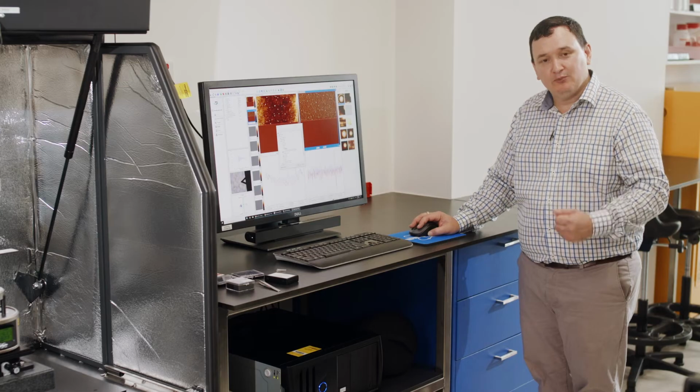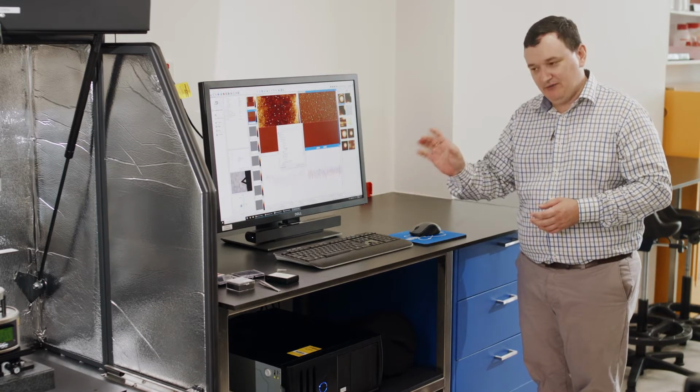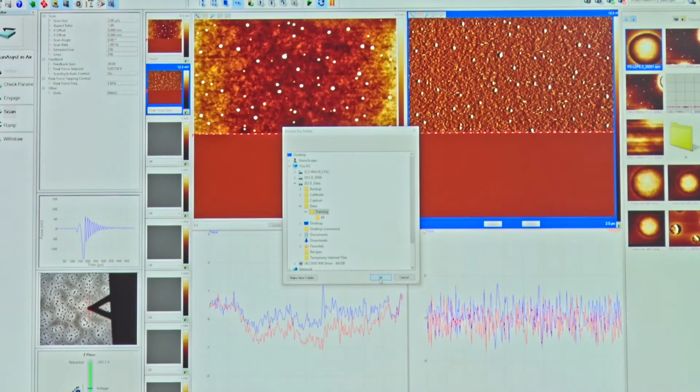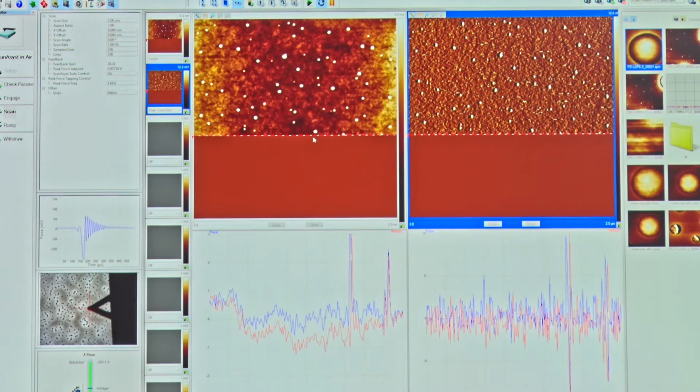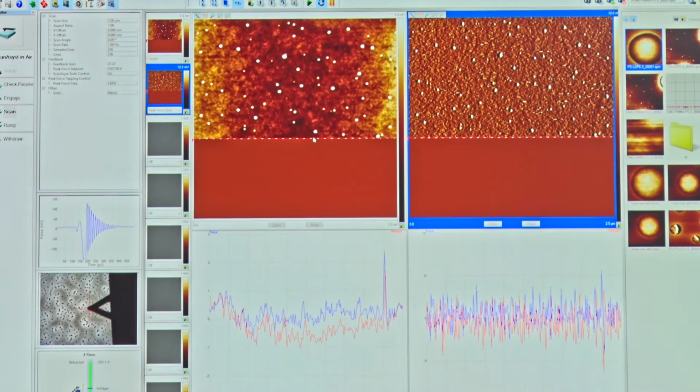Now you would normally put that under your username, and then what I would suggest is have a username, then your project name, and then something specific about this sample that will help you identify it at a later stage. So I'm going to come in here and click on training. We've already set this up. So that's the directory that I'm going to store data, but it doesn't mean we automatically store that data.